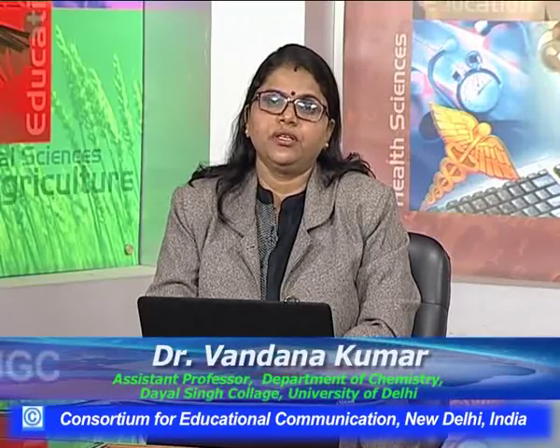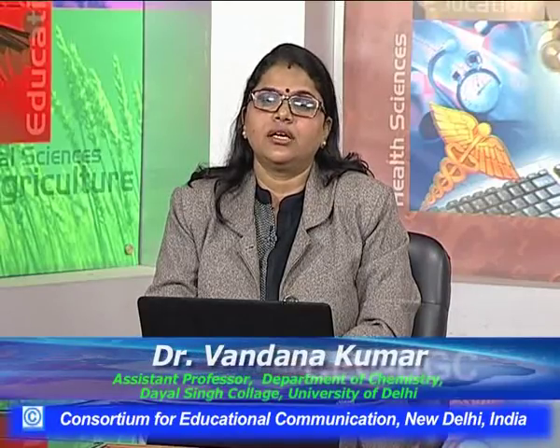Hello viewers, in the series of natural products and spectroscopy, in the part of spectroscopy, I have discussed many topics like ultraviolet visible spectroscopy in detail and their questions also. I have discussed IR spectroscopy, that is functional group spectroscopy. I have also discussed NMR spectroscopy in detail, and now it is time to discuss mass spectroscopy. I will discuss today the introductory part of mass spectroscopy, its instrumentation, and most importantly, McLafferty rearrangement.